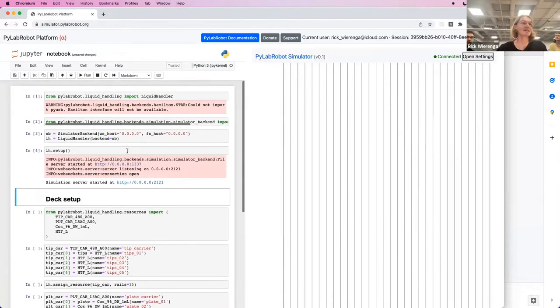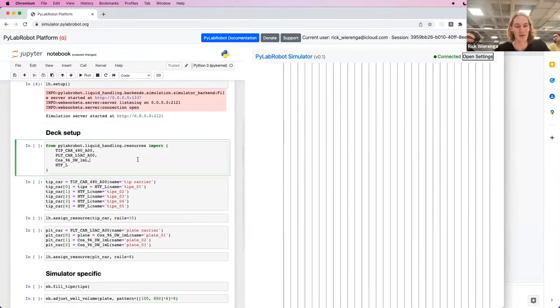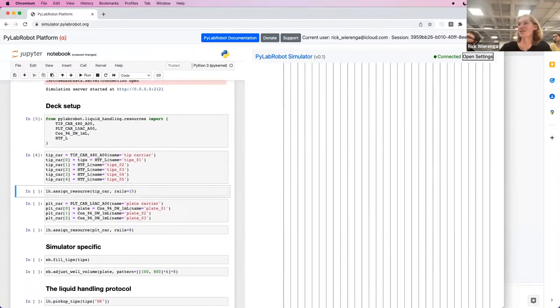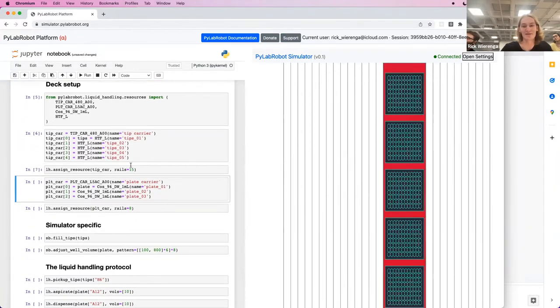As soon as I set them up, you can see on the right here, the simulator appeared. Then to set up the deck, we import a couple of resources. And then as soon as I assign a resource, like a tip carrier, you can see it appear on the right here.